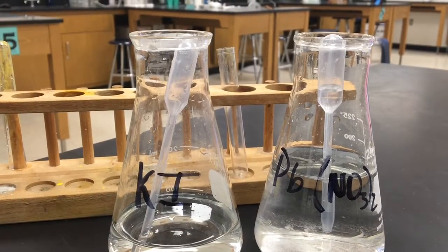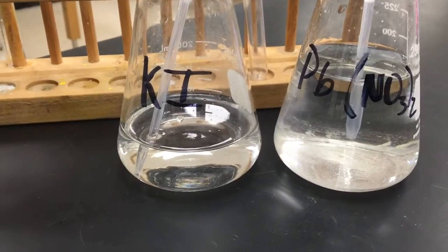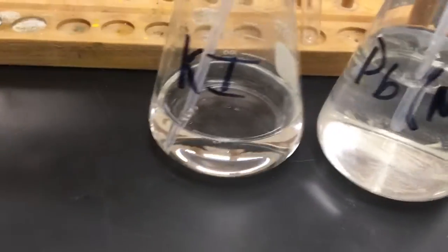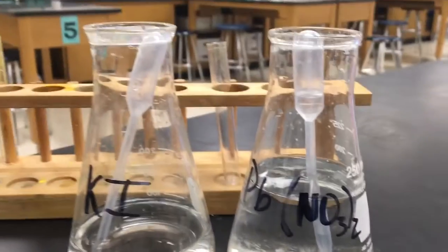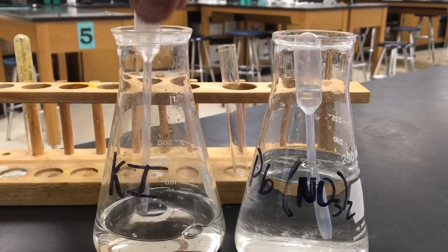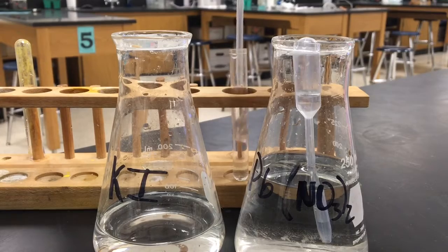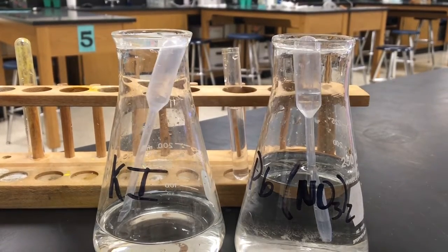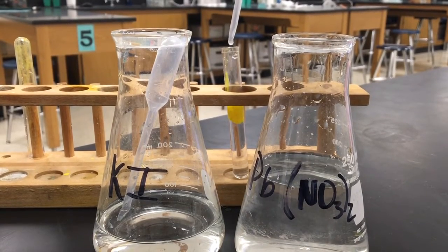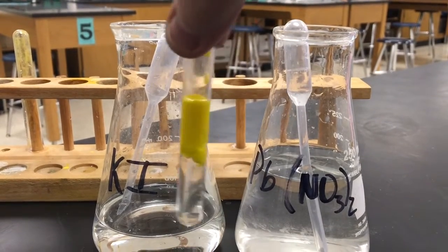So here at this station, we have some potassium iodide and lead nitrate. They look pretty similar, but I'll give you some views there, the simple before part of our reactants. And then we're going to fill this about halfway up with potassium iodide, and then we are going to add a few drops of this lead nitrate. Now I can pull this out.